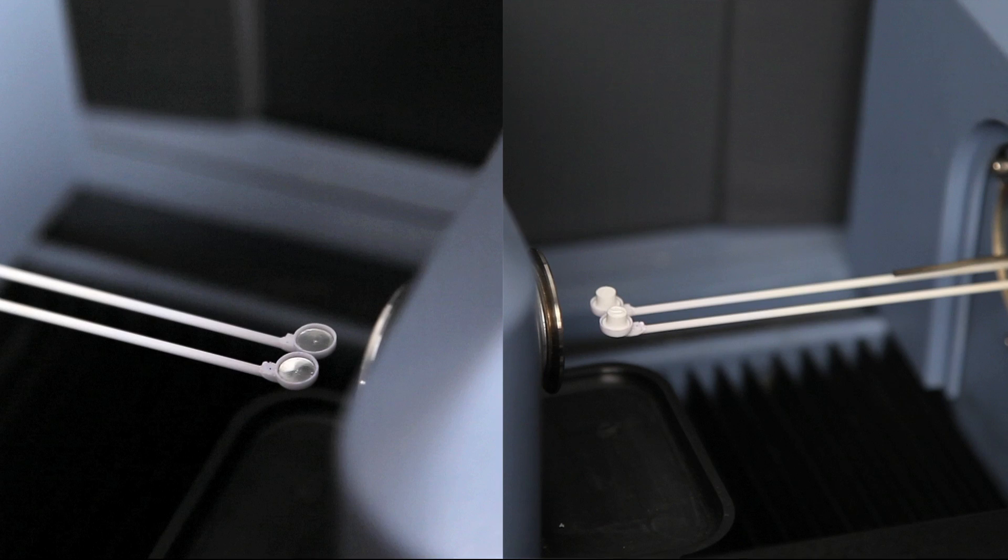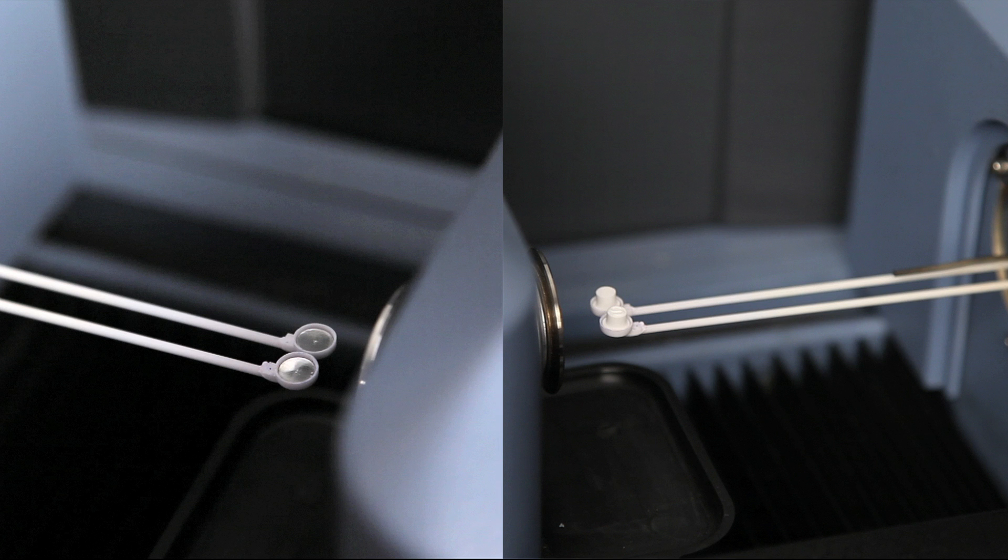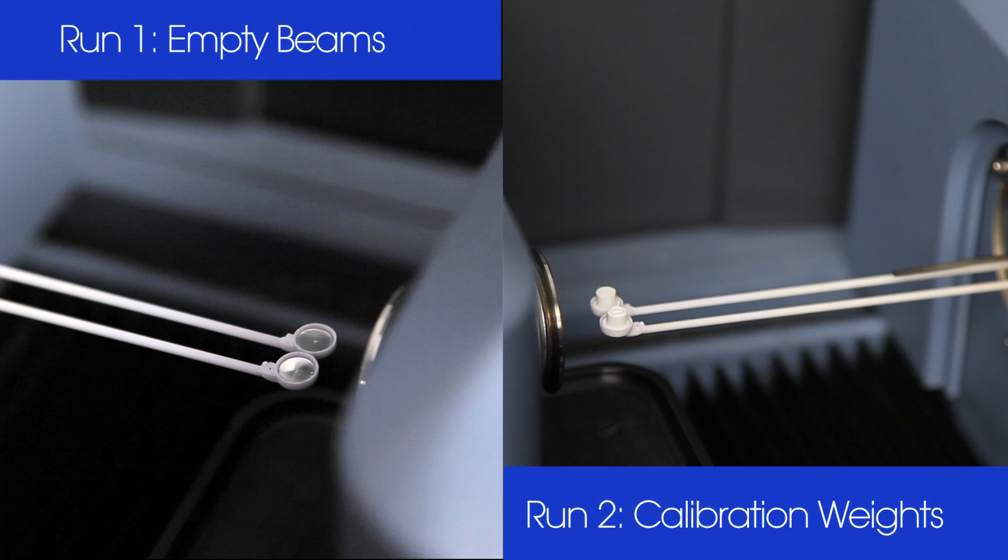The TGA weight calibration is based on two runs conducted in the calibration mode, one with empty beams and the other using calibration weights provided in your STT kit.